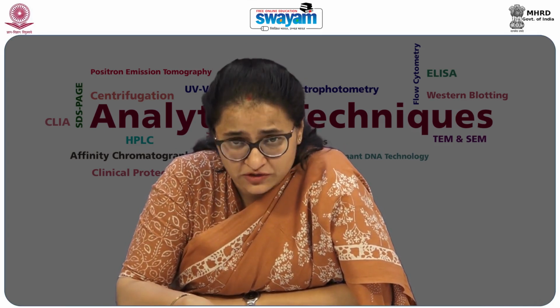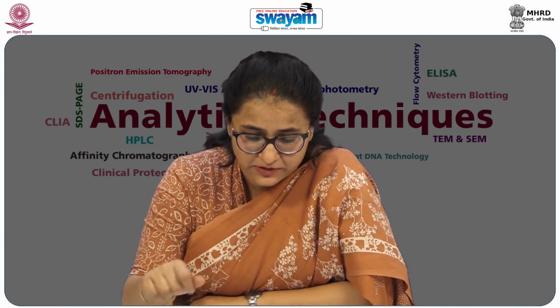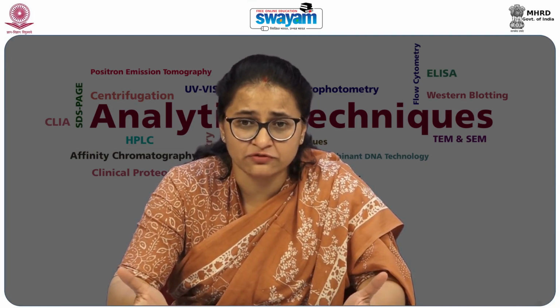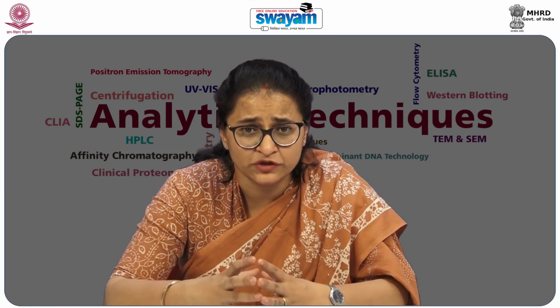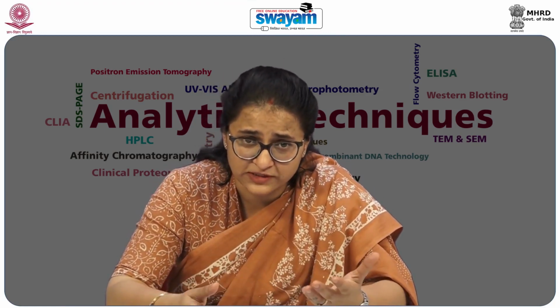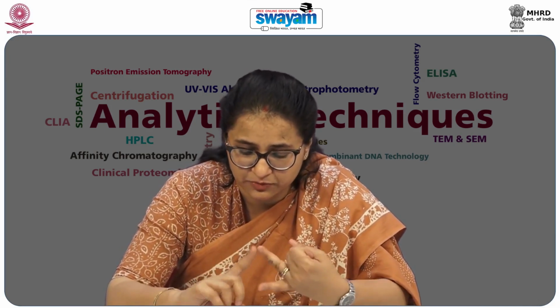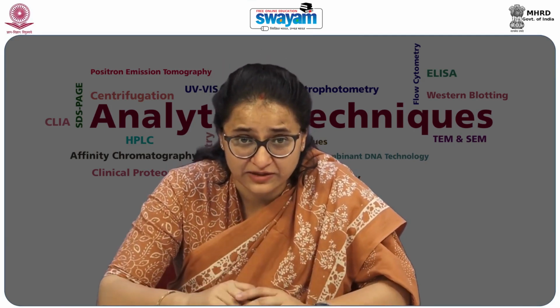Now, ideal conditions for these are: the spot development itself should be done in chambers and in a uniform, dust-free environment to help you visualize cleanly your analytes of interest. A lot of things affect the ultimate visualization, just as the separation itself. One is the vapor volume. So there are different methods by which visualization is done. It could be by dipping in your visualization solution, it could be by spraying, and it could be vapor phase contact. So we'll again reiterate this.